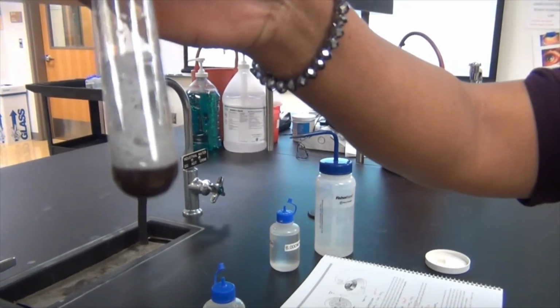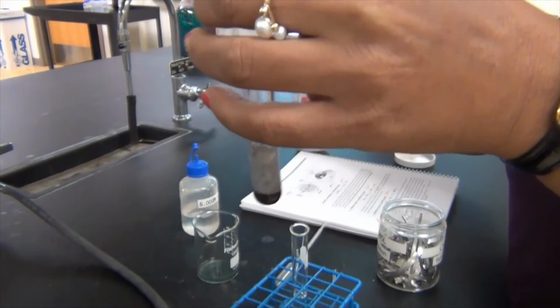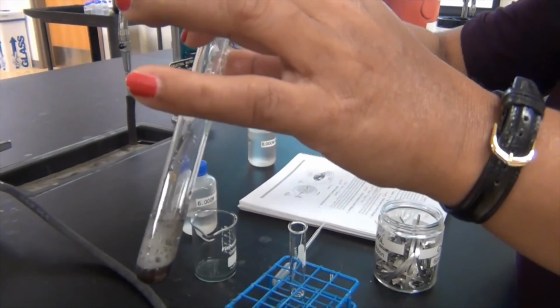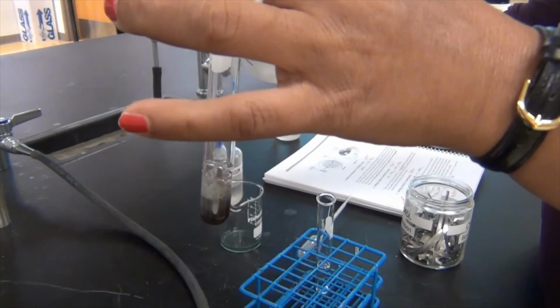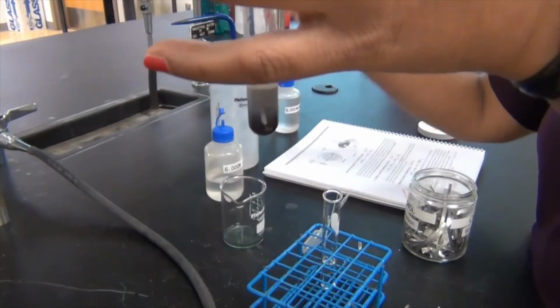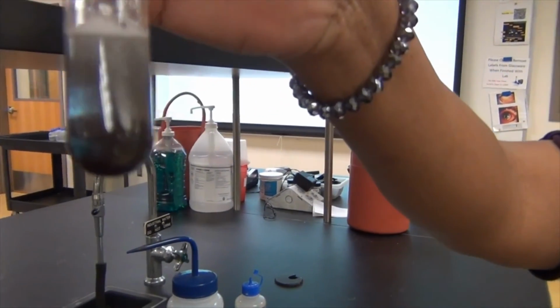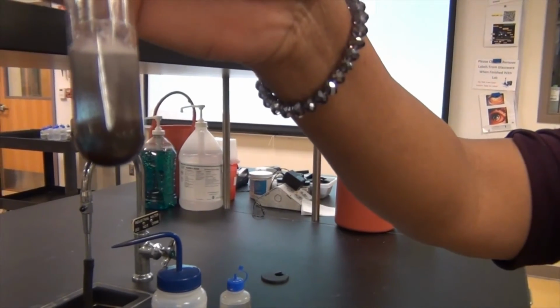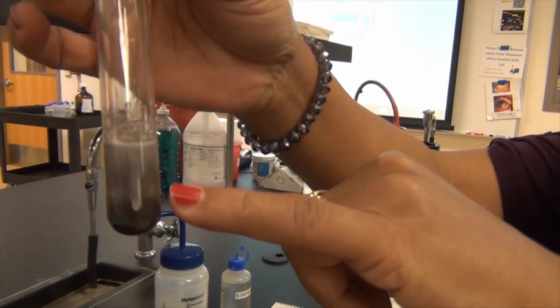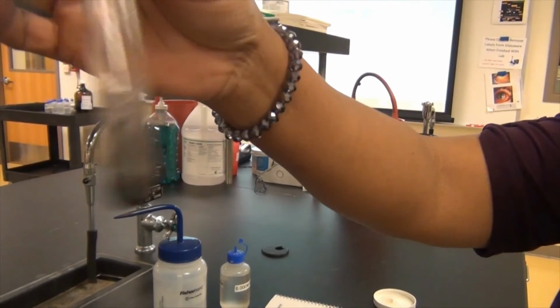Okay, now I'm going to add water to this, so you can see clearly as to what's going on. I didn't add water before. I'm going to add it now. By the way, the test tube is super hot right now. But I don't want to use the test tube holder because I know what happened before. I don't know if you can see this or not, but hopefully you can see the little piece of magnesium still there, and that's still bubbling.